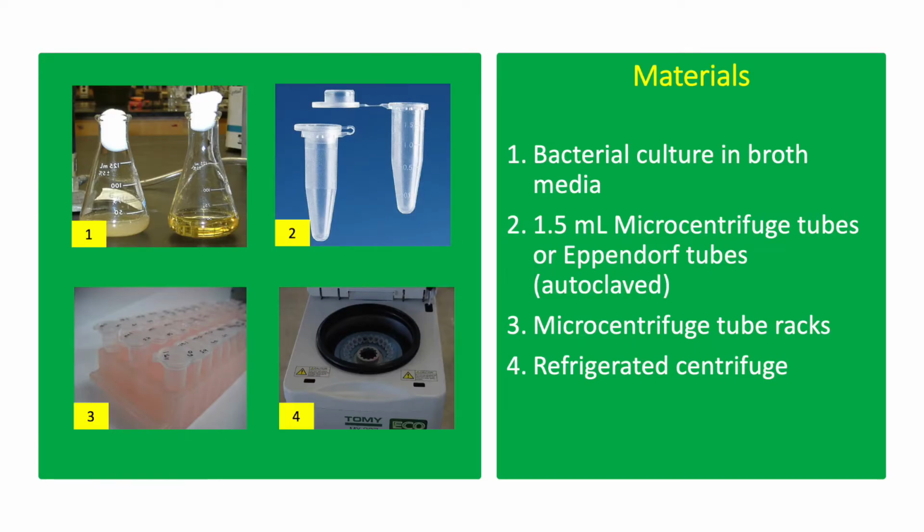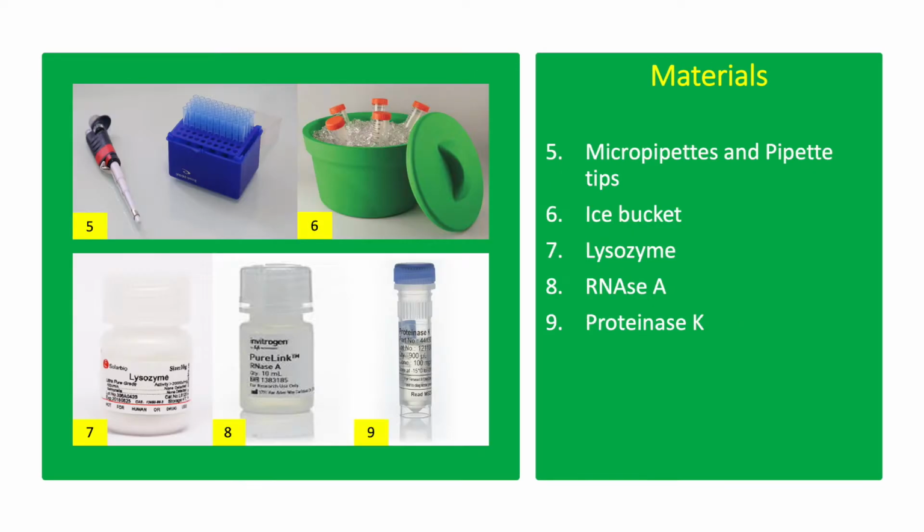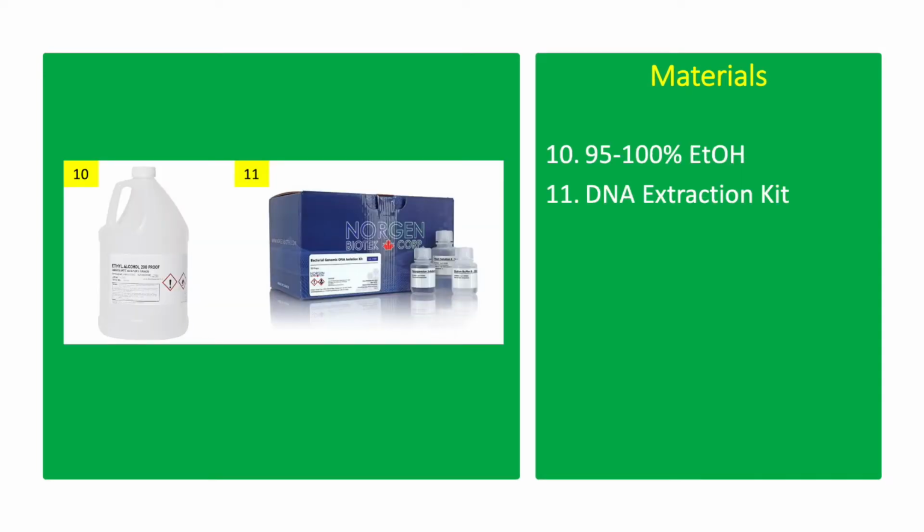The materials include bacterial culture in broth media, 1.5 ml microcentrifuge tubes or Eppendorf tubes, microcentrifuge tube racks, refrigerated centrifuge, micropipettes and pipette tips, ice bucket, lysozyme, RNase A, proteinase K, 95 to 100% ethanol, and DNA extraction kit.